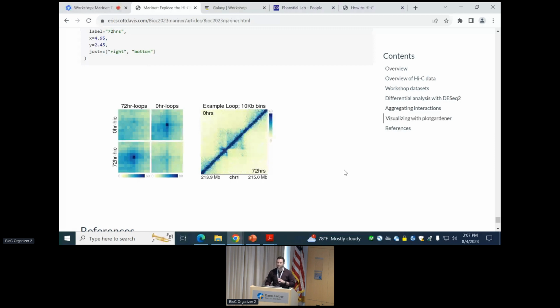Yeah, this is feature focused. So it's focused on not necessarily representing a HiC file as a container, but more the loops and what you want to pull from the HiC data. Or the domains and what you want to pull from the HiC data. So that's sort of the approach that this takes, is grounded in that.